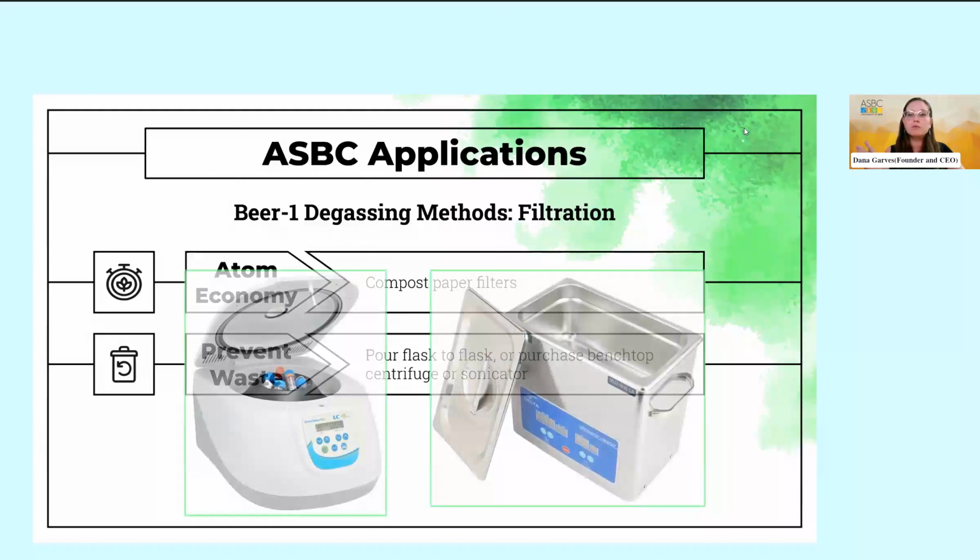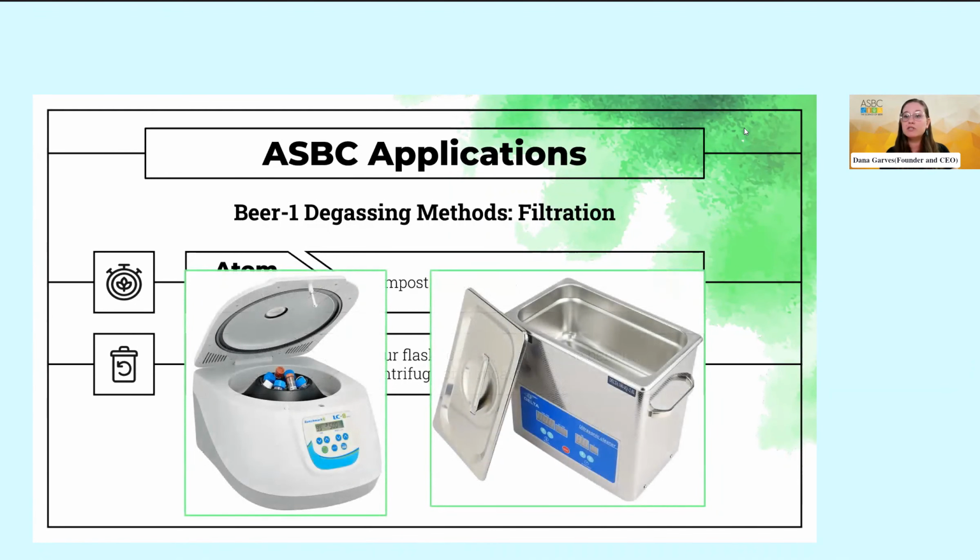Or if your lab is in a position to spend some money on equipment, a sonicator bath will very quickly get rid of that CO2 and costs only between $100 and $200. Same with the benchtop centrifuge that you can use to degas and also filter without creating any waste, and having dedicated centrifuge tubes for that.